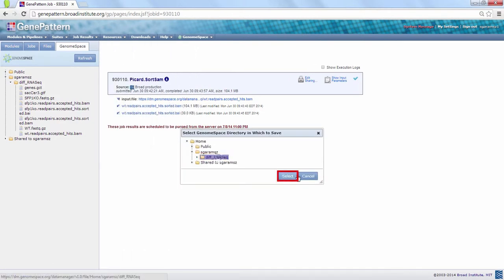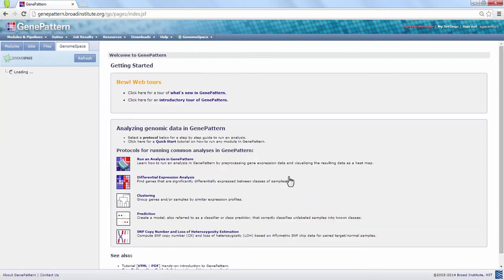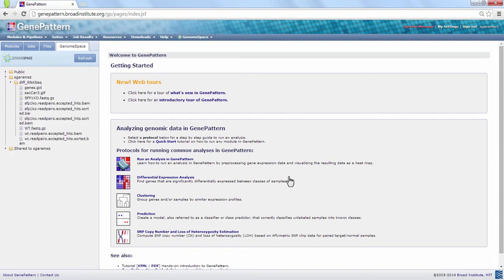For your information, the Picard Sort Sam module is an implementation of the Sort Sam function from the Picard command line toolset.